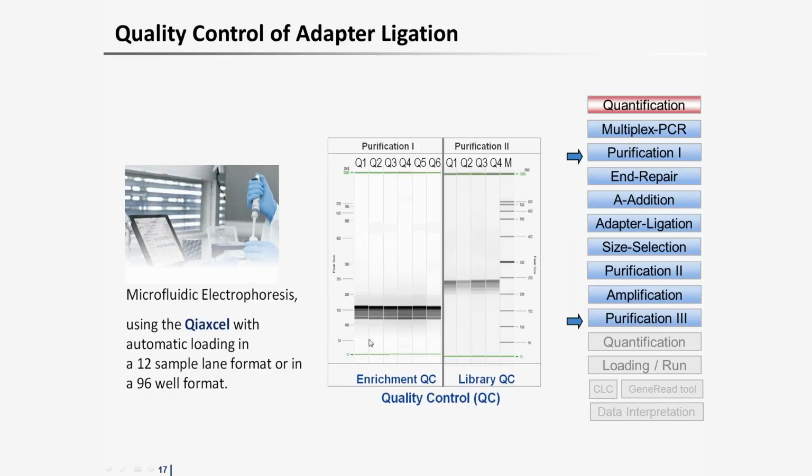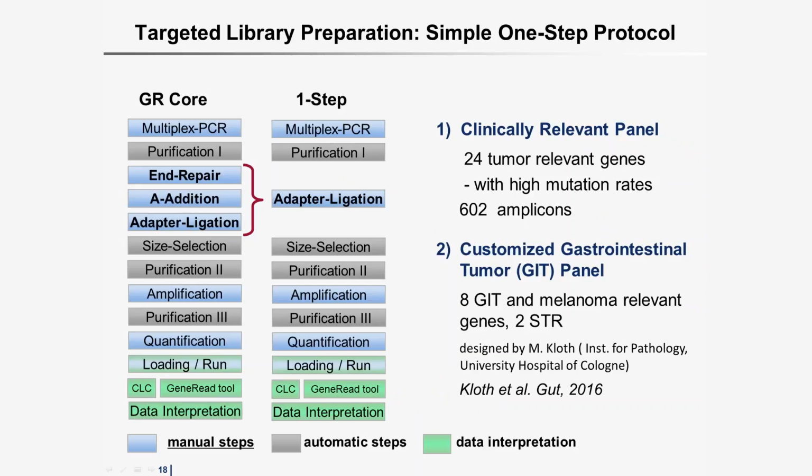And we are performing this with the QIAxcel capillary electrophoretic system, which is an automatic loading system, which is quite convenient.